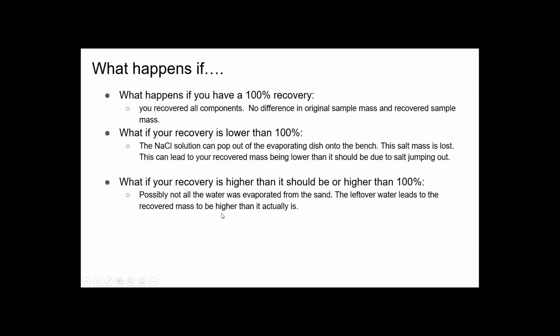So those are possibilities and things that happen in the lab. Where I teach elsewhere, we do work with sodium chloride solutions, and this happens a lot. Students don't either dry things enough or they lose their solutions, and it's very normal for my students to get over 100% or way under 100%. Never exactly 100%. I don't think that's ever happened. Anyway, these are scenarios. Read the questions carefully. There's other variables here, so you need to make sure you're actually picking the correct one.